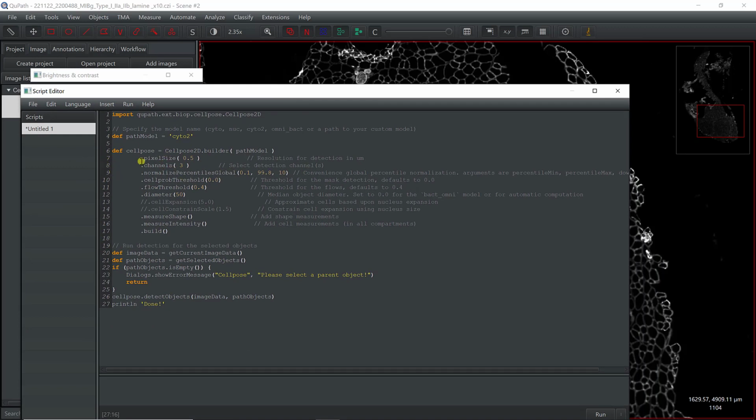The normalization, and the probability for the presence of cells, which here are not cells. Actually, we're using Cellpose for muscle fibers. Just remember that this is not between 0 and 1, but between -8 and something like 16.